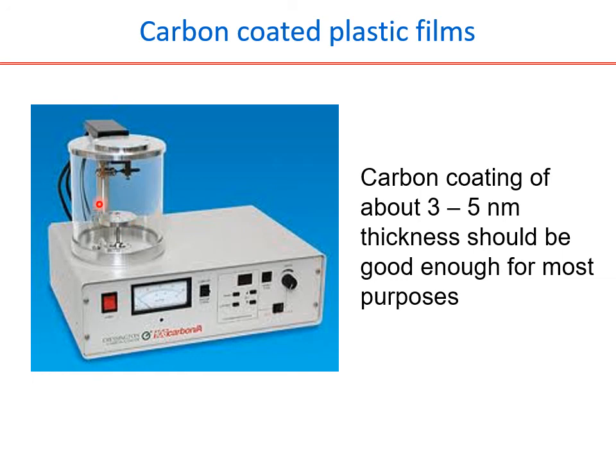So you have to be utmost careful in protecting the grid between the glow discharge and the sample staining. That is the precaution. And if by any chance you sense that the grid was in contact with anything else other than your sample after glow discharge, it is better to discard that grid and start afresh with another experiment, instead of wasting time taking that contaminated grid to the electron microscope experiment. So that's about the carbon coater and the glow discharger.